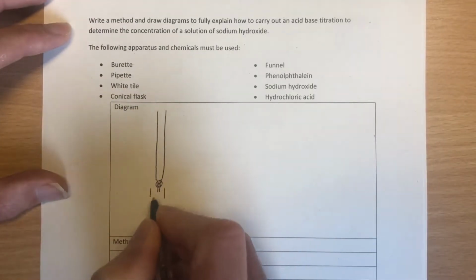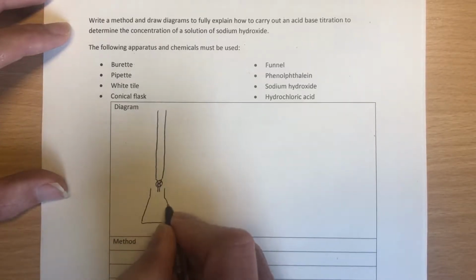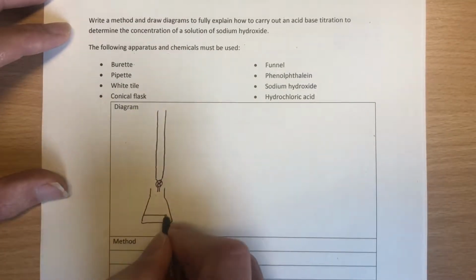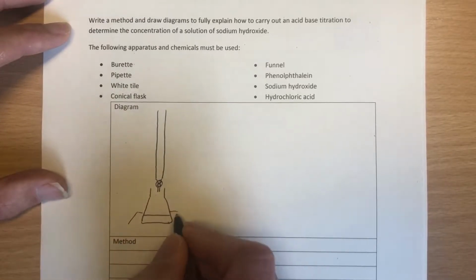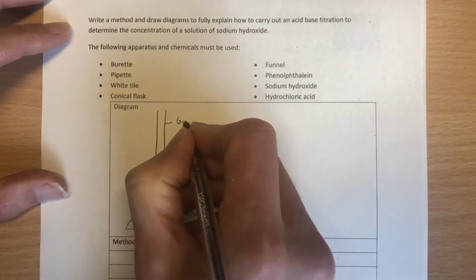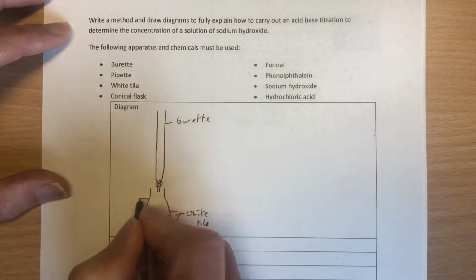Underneath that, we're going to have a conical flask, like so. It looks a bit like a cone, hence conical flask. And into that conical flask, we will put the sodium hydroxide. On that conical flask, we will put it on a white tile so we can see the colour change nice and easily. So this is the burette, and that's our conical flask.